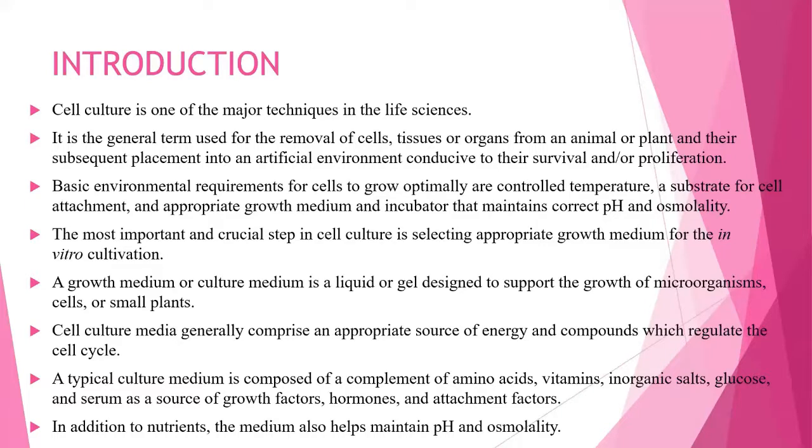So we have to re-sterilize the entire incubator, and in some conditions we might have to sterilize the entire room also. For such things, the importance is about how you maintain your lab and how you maintain the requirements of a cell culture.